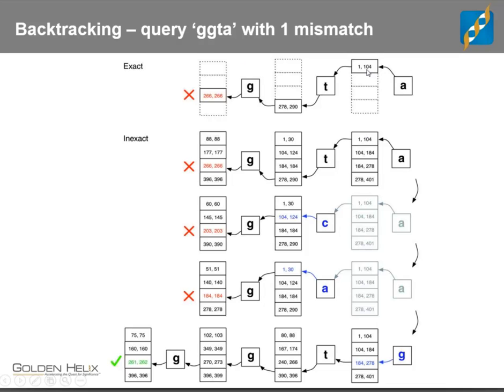So essentially, where is that in that first column? And we can represent that because it's sorted as a range. The first row to 104th row have A's. You create this index which then says, okay, for all the letters that have an A, which rows then have a TA, and you can follow down this index.